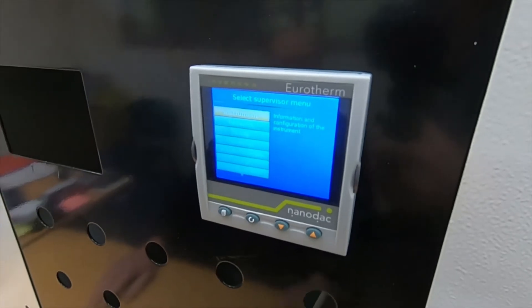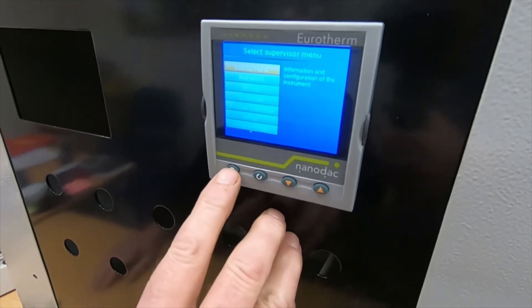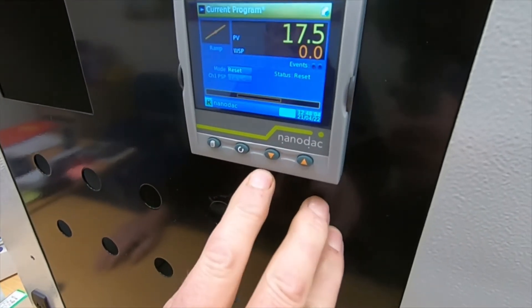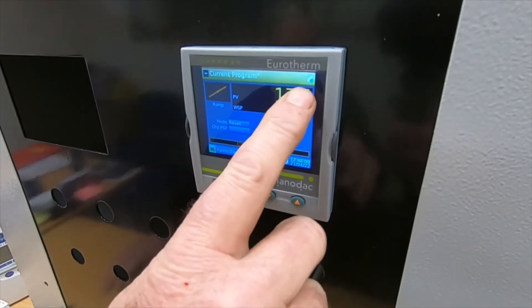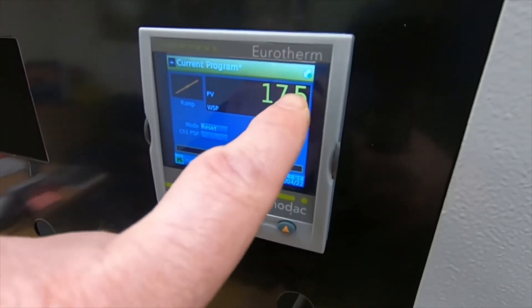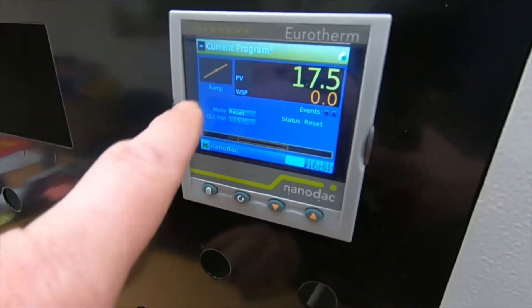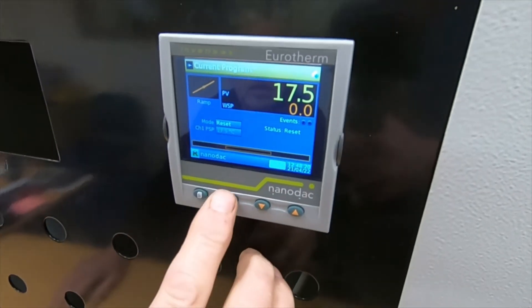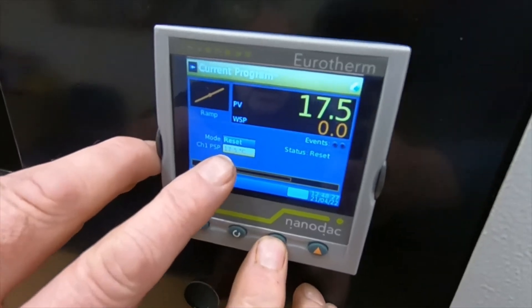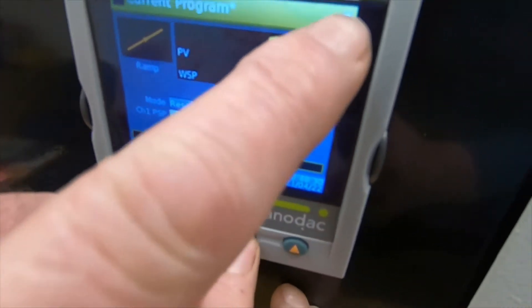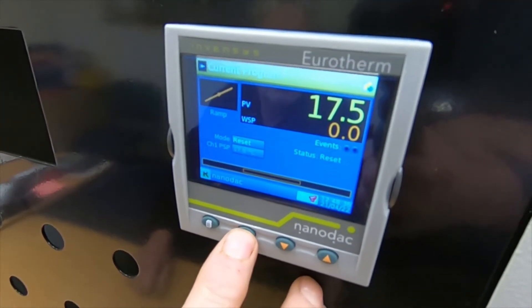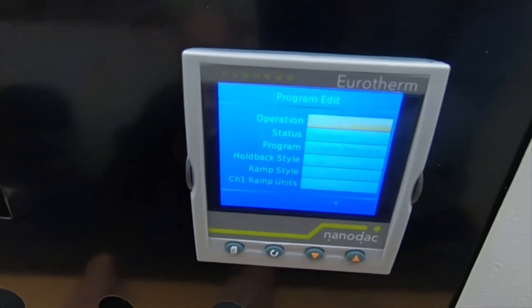To access the programming mode, press the page button once, then twice, and use the down cursor to select your loop page. Notice in the top right-hand corner there's a page symbol — that's the screen we're looking for. To access that page symbol, highlight reset, use your down cursor, and the next item will change. Press down again to go to the top corner where the page symbol is highlighted. Select by pressing the scroll button and now you're into programming.